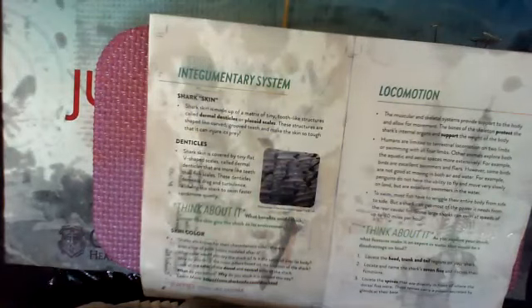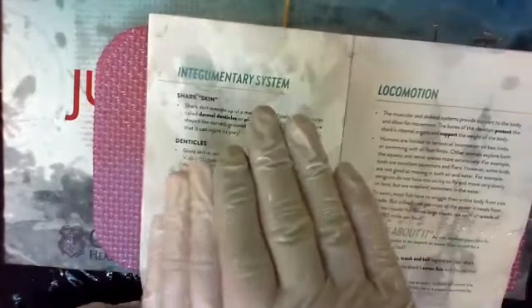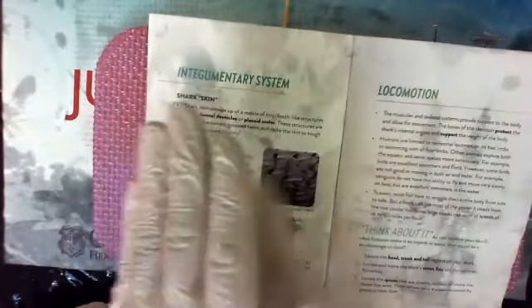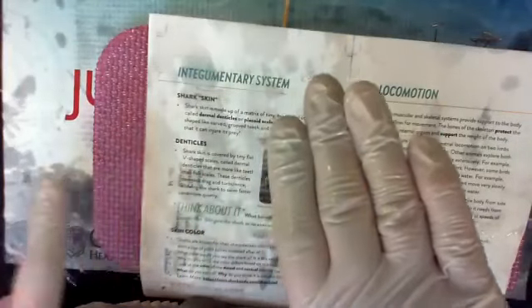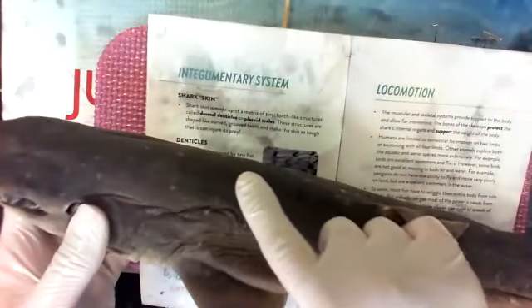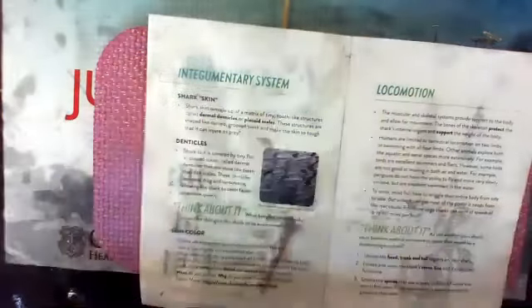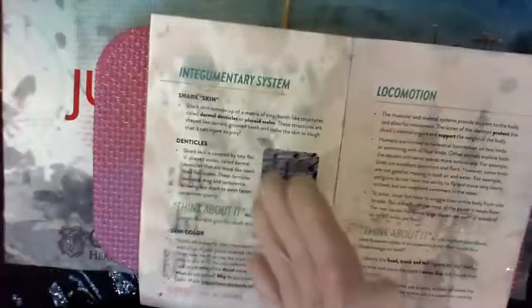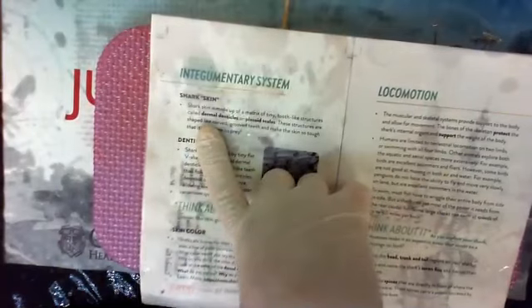Denticles are like shingles on a house, not shingles like the painful stuff that people get. So if you look at their shape, you'll have one that overlaps another one that overlaps another one. So in one direction, you would go off this one, whoop, drop into the next one, whoop, drop to the next one, nice and smooth. But if you go backwards, it's uncomfortable. Here they drop off to the next one, you go backwards, not comfortable. We call them denticles because if you look at just the prefix of denticle, what medical profession starts with dent?